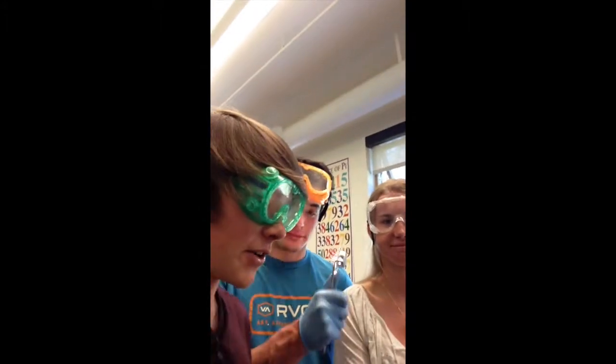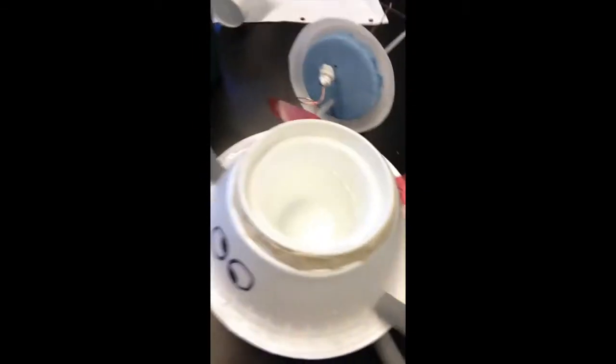Today is June 4th and our group is Cole, Dominic, and Sarah. We're doing the specific heat of a metal lab. Here we've got some lead and here's our calorimeter.